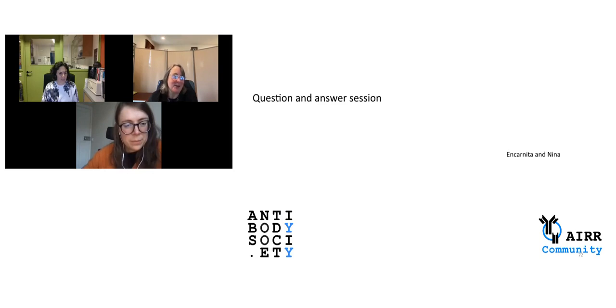Yeah, that's a great question. I often think of that question in reverse. So for bulk sequencing, when you have very low input, all kinds of horrible things come into play that are harder to control for. When you have the luxury of a large sample, it makes your life 100 times easier, because you can build replication into the experiment. You can make independent biological replicates for DNA, of course. If you independently sample separate aliquots of bulk gDNA, that works as an independent biological replicate, because each cell only has one tag, right?